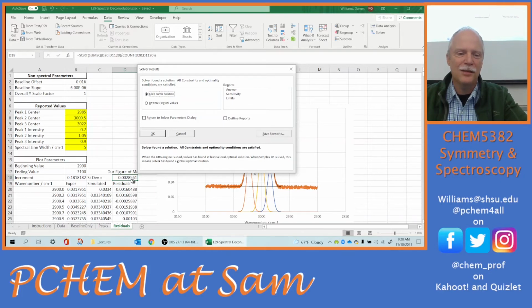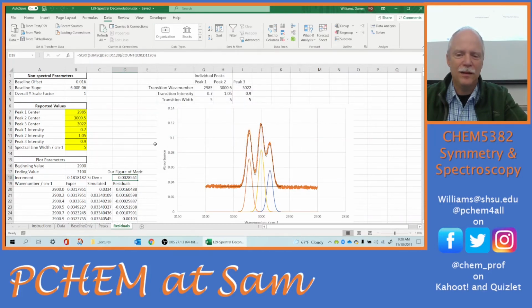And it went down slightly, I think. What was our old one? 2.8. I don't know if it moved. You don't know if it moved? Okay. Yeah, I have 285 written down. Okay, so it didn't really move. Our baseline was already kind of optimized. Do you want me to de-optimize it? And then, well, our peaks, we'll see what happens to our peaks.